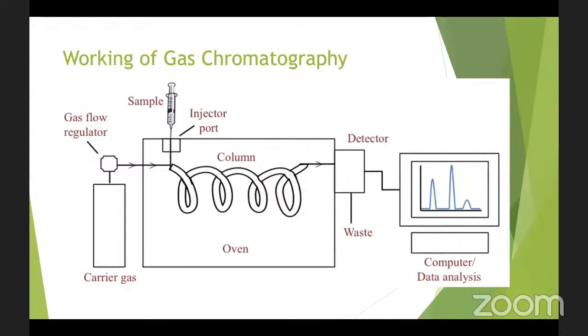After the column, the next is the detector. The detector is the thing responsible for detecting the components that are coming out of the column.